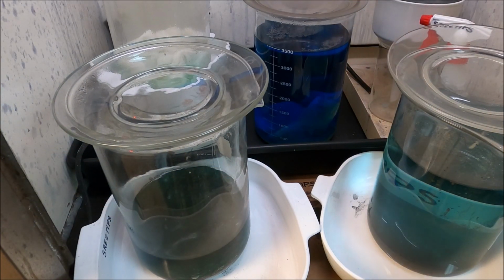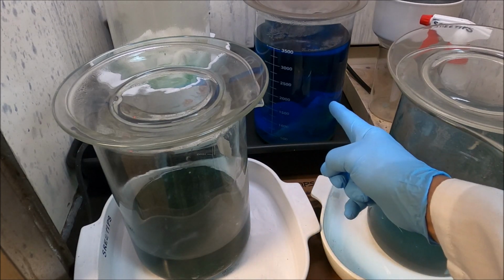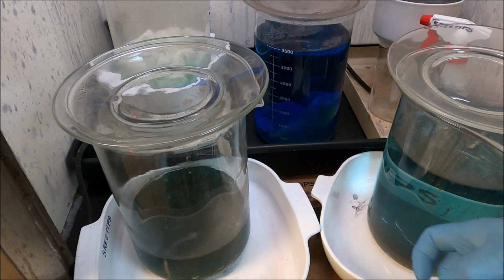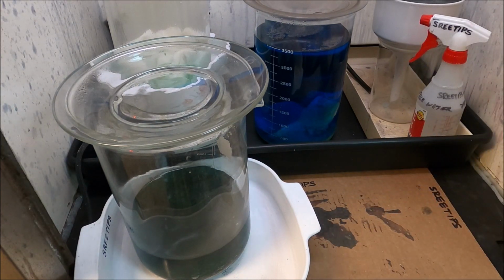Everything is just like we left it. Here's our solution with the finely divided solids that have settled out at the bottom of this beaker. We're going to draw off that solution and add it to our beaker that has copper in it to get the metal silver to cement out of this solution. First, I'm going to pull this out of the way and move it to the side.